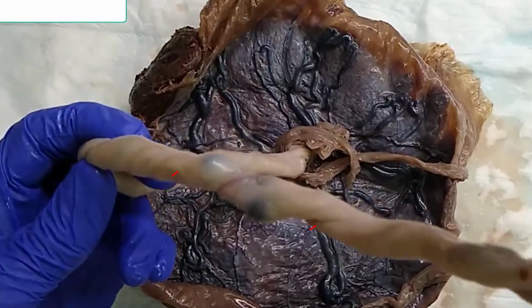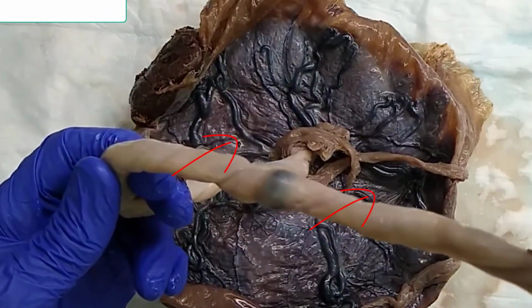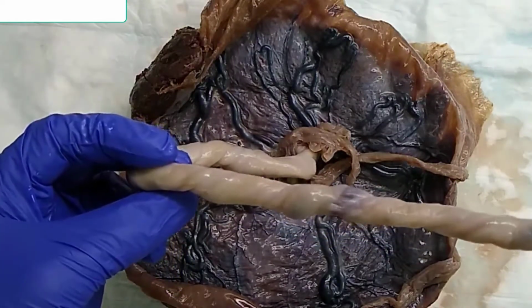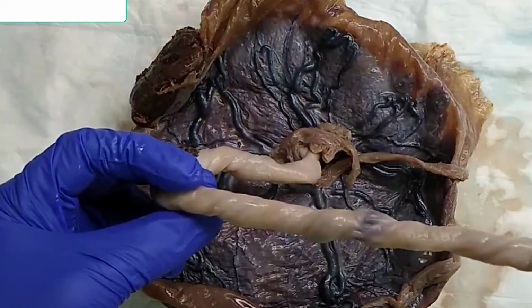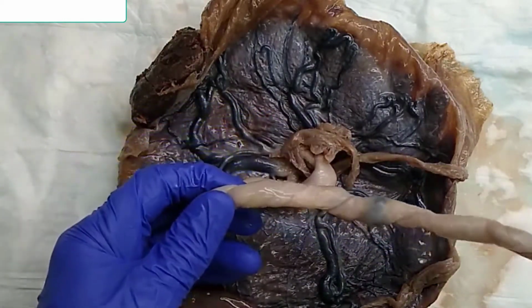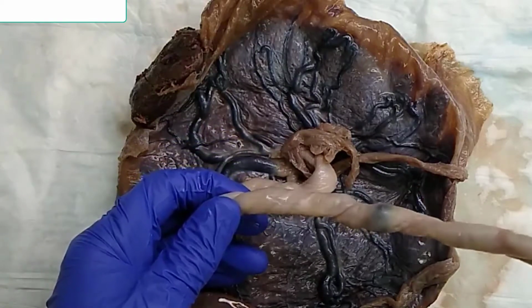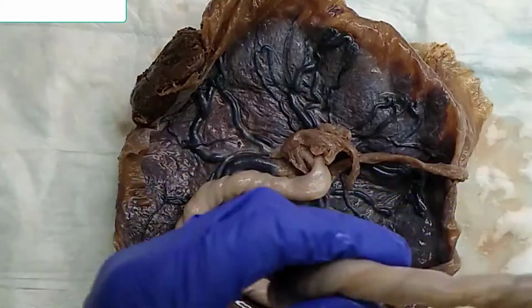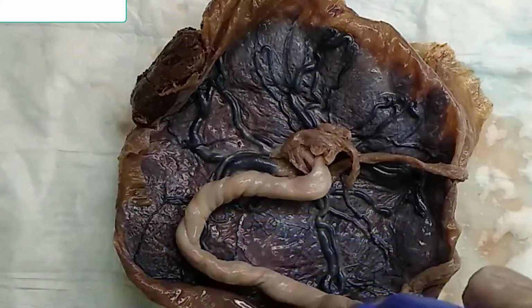which you can see in this cord, kind of like a barbershop pole, which may date me, but the coils generally are, or should be, in the range of 1 to 3 per 10 centimeters. More than that is considered hypercoiled.